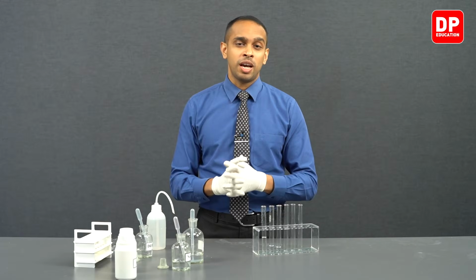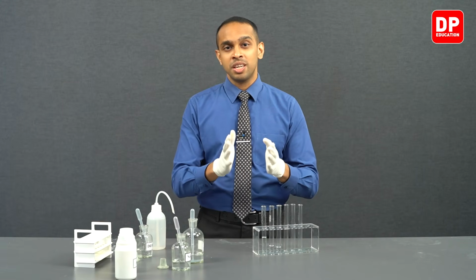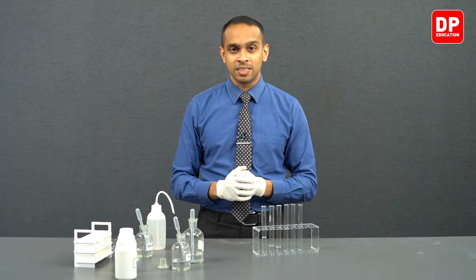So therefore, the precipitate that is formed will disappear. And at the same time, zinc hydroxide will react with acid as well to form a clear solution once more. So therefore, students, you will observe a similar reaction with zinc 2+ ions as well that can also be used to identify the presence of hydroxide ions.